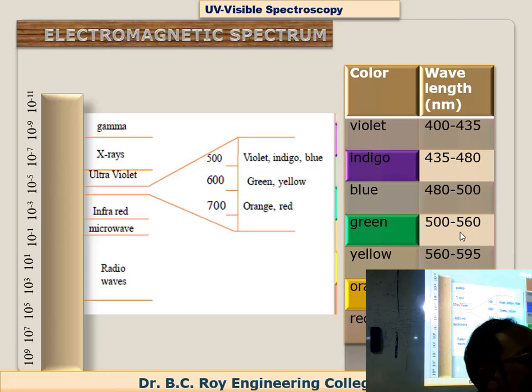So that can be photochromatic. What is the meaning of photochromatic? Photochromatic means, if light falls onto some matter, it becomes colorful. That is called photochromatic. Monochrome, you should know the term. Monochrome, single color, right? Single color. But that single color also contains so many wavelengths.